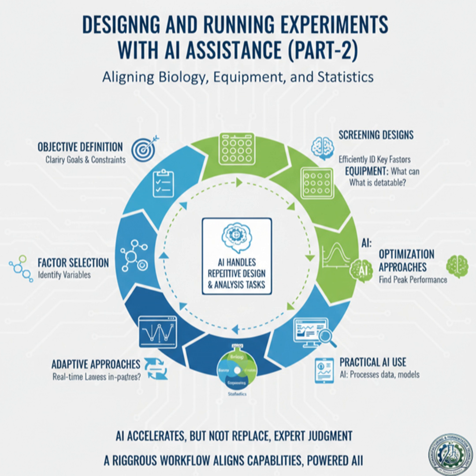I laughed when I read that. It's such a perfect description of the problem. What does statistically cute actually mean? Well, statistical software, and AI for that matter, it loves symmetry. It loves orthogonality. So if your center point is, say, pH 7, the software will naturally suggest testing pH 5 and pH 9. Right, a nice even spread. It looks beautiful on a design chart. It maximizes the statistical variance.